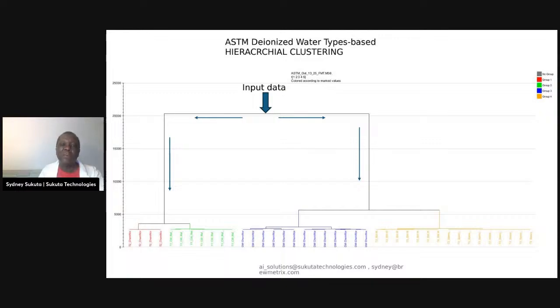I'm talking about water, but another thing you can use this for is to look for similarity between your products or even the competitors. Maybe there's a leading product, and we can run something like this to see your positioning in two ways. One is compositional: how do they compare? Another is sensory panels, and we can run those and tell you how it compares. Ideally, if this is the leading product, you want yours next to it. But if it totally goes the other way, maybe you have some work to do. But anyway, back to water, we look at these similarities.